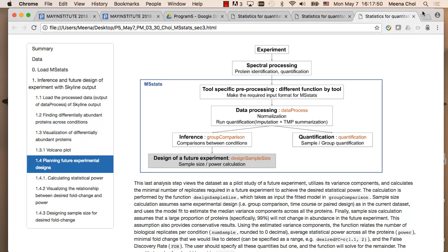And then actually I make a branch, which means we can go in any direction; any other downstream statistical analysis can be applied. Group comparison is one of these. And here, for data processing, we provide two different outputs, the processed data or the run-summarized data. We use the run-summarized data for group comparison, but that output can be used for any other statistical analysis.